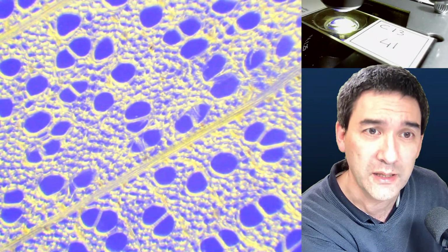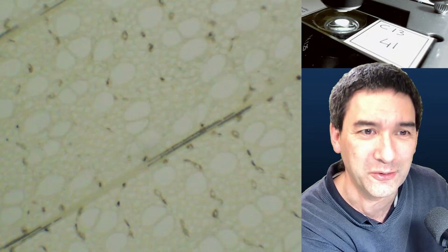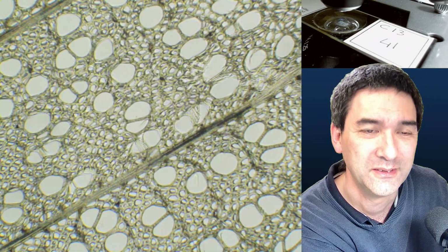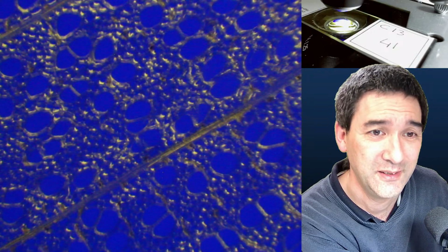How does it look without a filter? I always have to turn down the light intensity again. This is how it looks without a filter. Maybe I have to close the diaphragm again. So without a filter, natural colors. Okay, and here again.